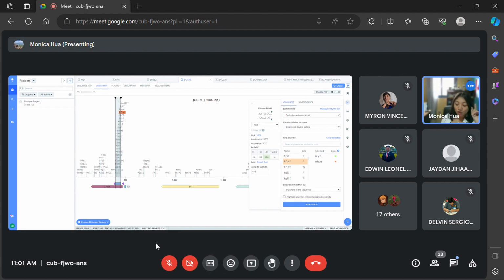You can choose 2 different ones, but I don't want to confuse you. So just choose a cutting site that has one. I could make it more complicated and ask you to choose two that have two, but maybe in class we could discuss it. That's why in class is better. I could write it on the board.